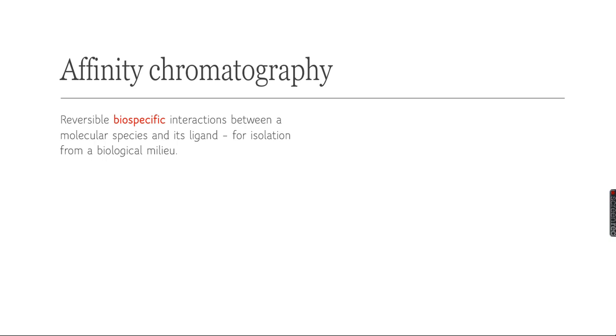In this class we are going to discuss affinity chromatography, or sometimes we'll term it bioaffinity chromatography, because most of the time we are utilizing the property of biological molecules to have a specific affinity to some compounds. So it is very specific in nature and mostly used for bio-based material. It is a reversible and biospecific interaction between a molecular species and its ligand for isolation from a biological milieu.